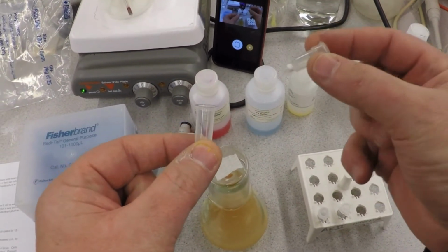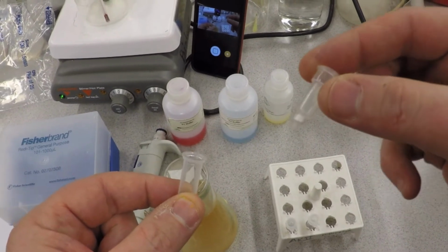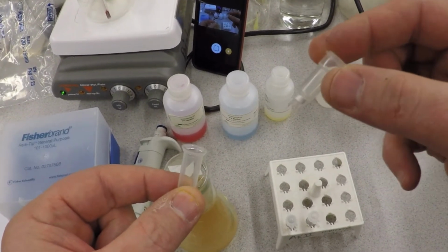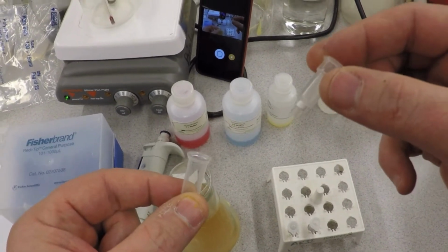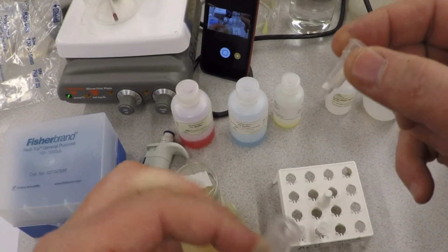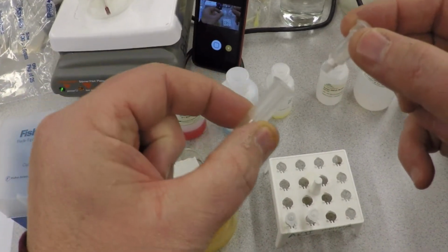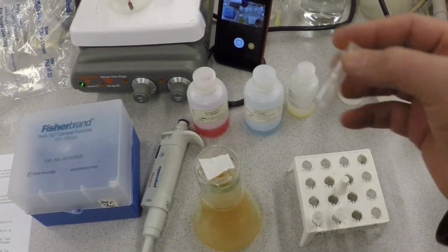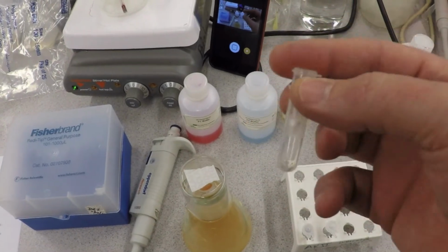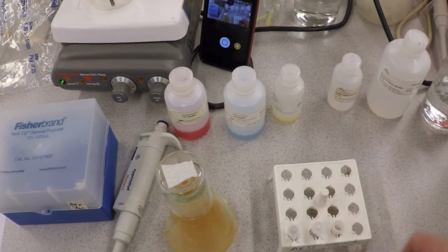This is a little glass-filled, impregnated little mini Eppendorf tube, essentially. But this is where you're going to catch your DNA, and you elute it from this white stuff, and we'll talk about that. And then this is just a collection device. So that's essentially an exchange column, and we'll show you how that works.